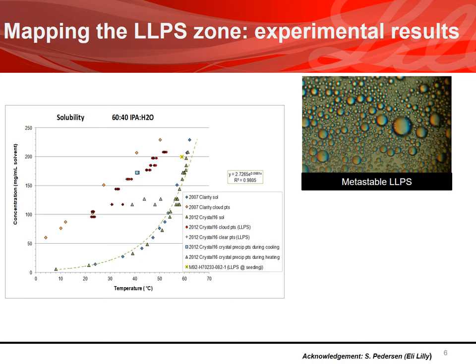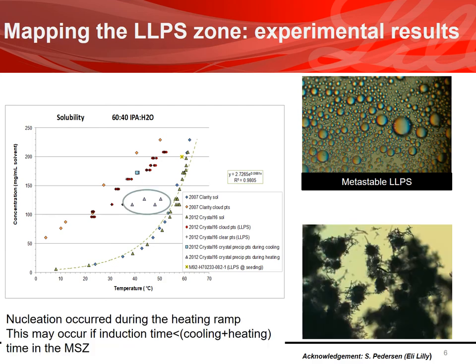This approach is applied at different concentrations. The phase diagram of Compound A in a 60:40 IPA-water mixture — water being the anti-solvent — shows oiling across the tested points. Some outliers occur during the heating ramp because an unstable LLPS forms where the oil droplets eventually crystallize, which can happen if the induction time for crystallization is lower than the time spent by the solution in the metastable zone during the cooling and heating ramp.